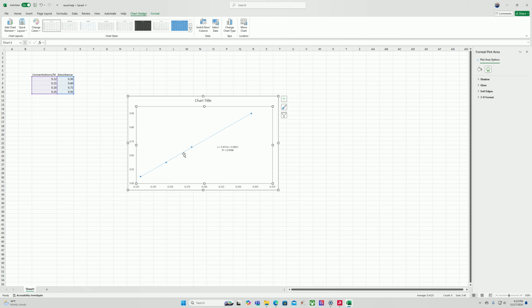You can visually see that, because the dots are close to the line. And so we can look at this r squared, and it quantifies how close the dots are to the line, and the closer it is to 1, the better. So this is a nice linear graph. Even if it wasn't, it's probably the only data set or the only model that you're testing a lot of the time. So you would have to use it anyway, but it's good to know and then reference in a discussion question if it came up.